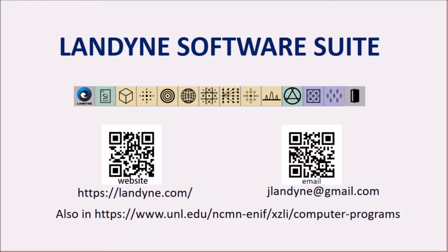In this video, I will introduce SVAT. This is a key component in the Landyne software suite for electron diffraction simulation and crystallography analysis. The software can be downloaded from the website on the screen.